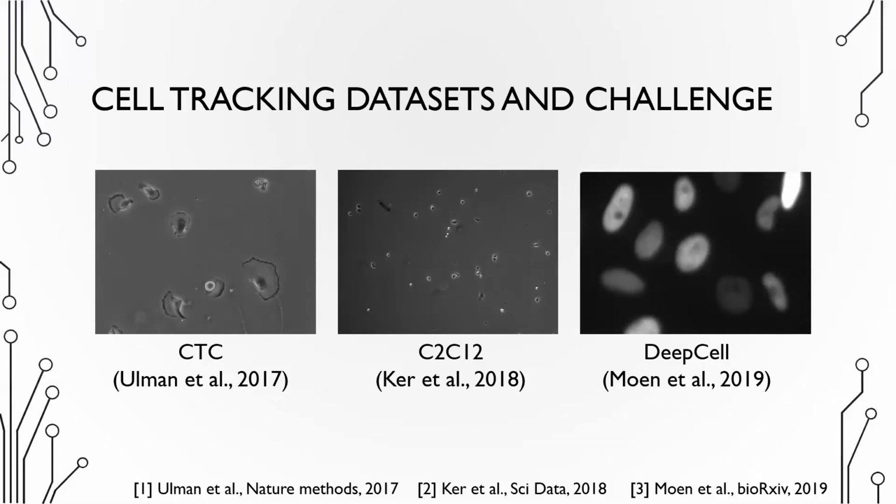CTC is one of the first datasets, which was originally released in 2015 and was later updated in 2017. C2C12 was released in 2018 and contains phase contrast sequences, and DeepCell was released in 2019, which offers fluorescence microscopy sequences. However, there's still work to be done.